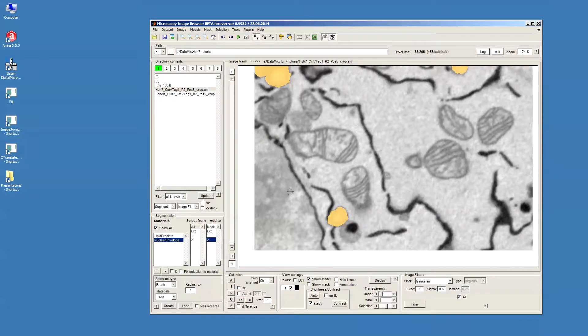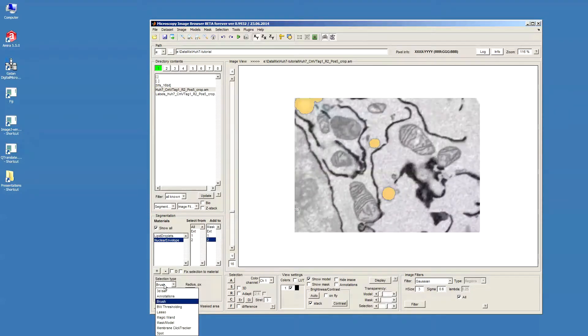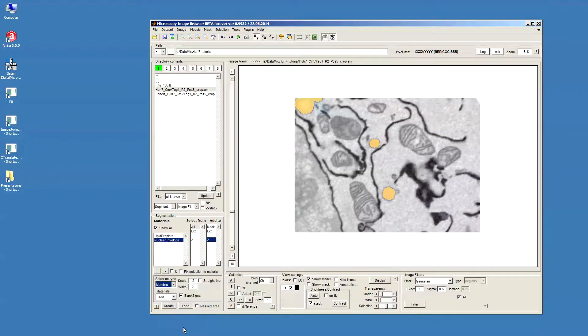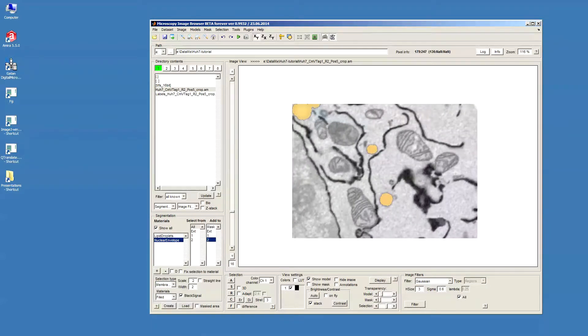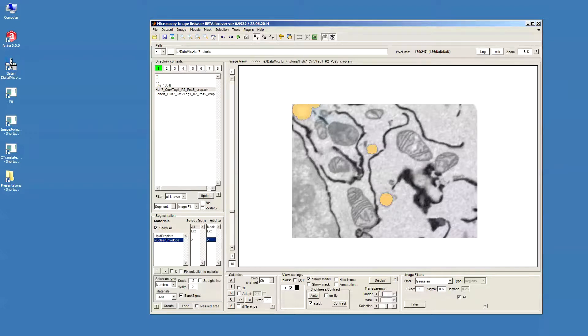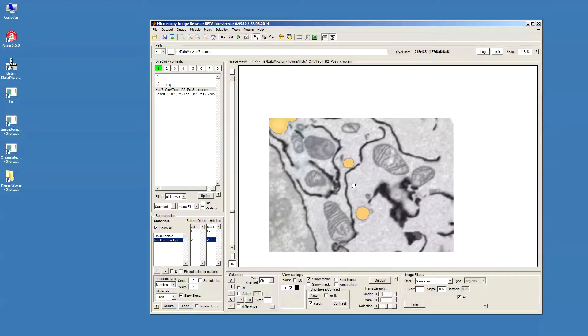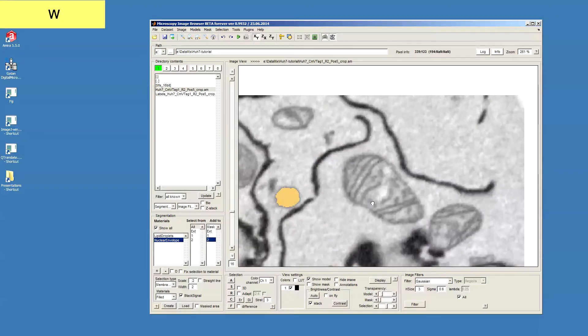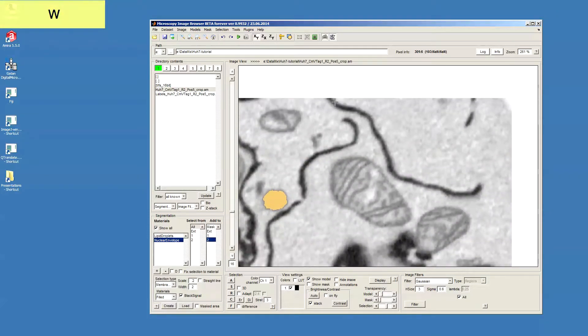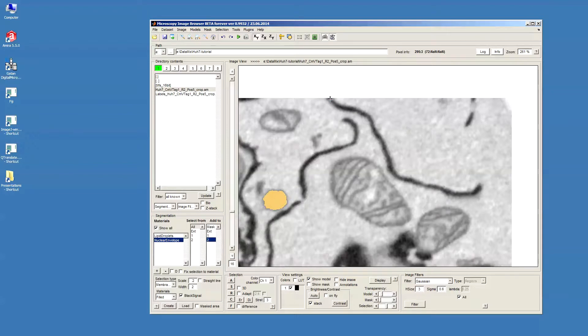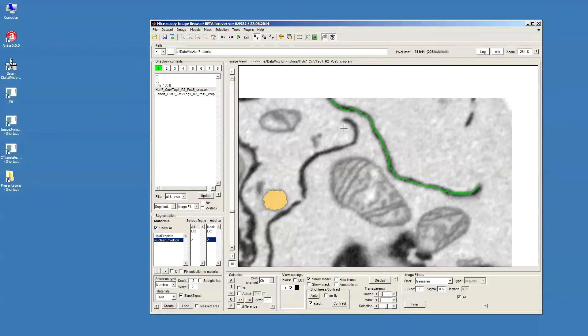Now, for the segmentation, we first go to Selection Type and then go to Membrane Click Tracker tool. This tool allows to trace the membranes in the datasets. In order to do that, we can use Shift and mouse click to define the starting point of a membrane profile, and then we can just press the left mouse button in order to trace this profile from the starting to the ending point.